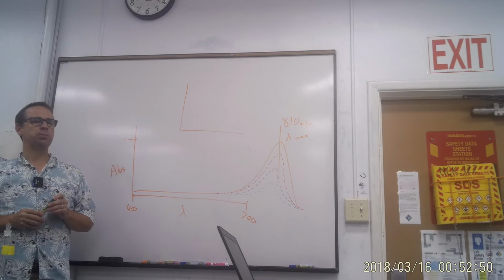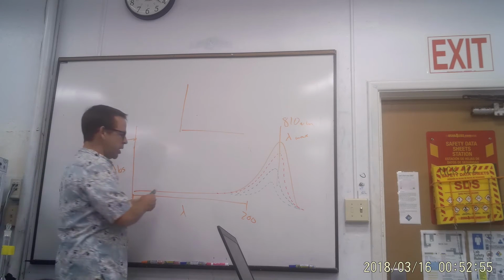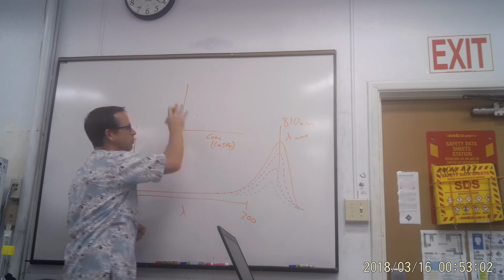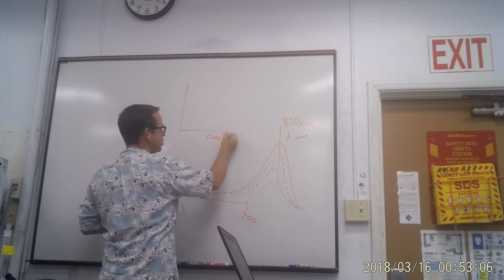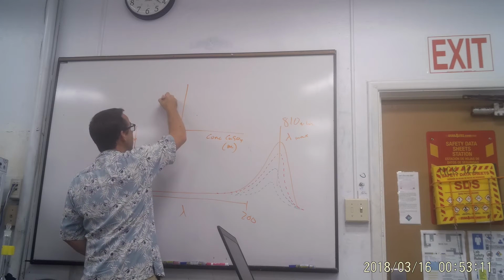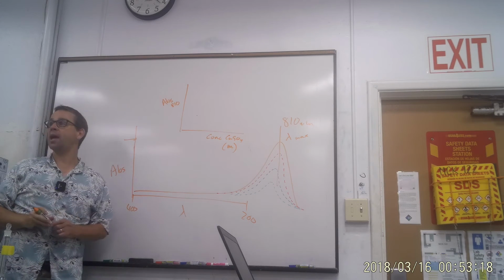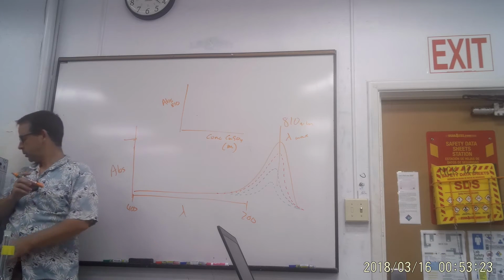To find a relationship between what? What do we want to do? Concentration, different concentration versus what? Concentration of the copper sulfate in this case, right? That's right. The absorbance, concentration of copper sulfate, our units are molarity, and the absorbance at a given wavelength, right? Which we want to choose the max if we can, so that our relationship is the most sensitive. Okay?